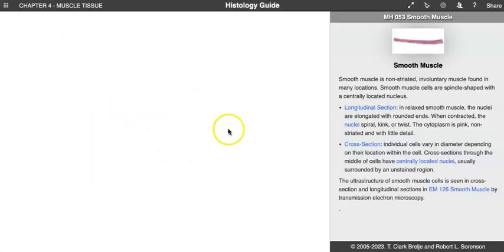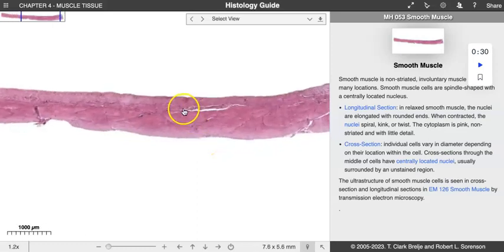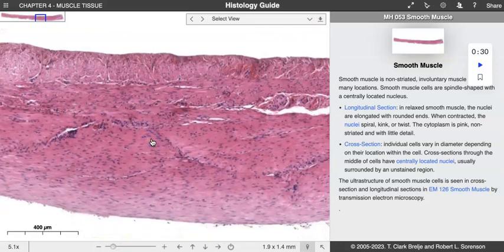If we just look at a longitudinal section of smooth muscle, it will look something along this line, right? And if we increase magnification, you can see there is a lot of texture going on here. From this border up to here is a longitudinal view of smooth muscle cells, and from here to there is looking at the cells in a cross-sectional view. This is very similar to what we would see in the lower part of the esophagus. We would see an additional third layer in the stomach, but then we would see this very same pattern as we get to the rest of the intestinal section.